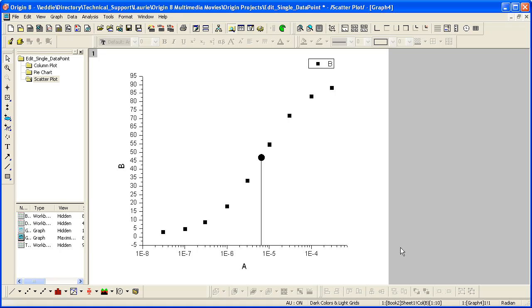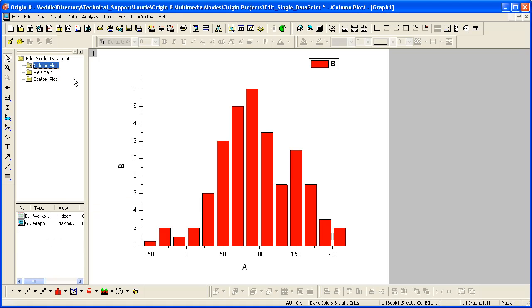This point-by-point control is available for other plot types as well, such as column plots. Since I just want to change the fill color of a column, I'll use the style toolbar.